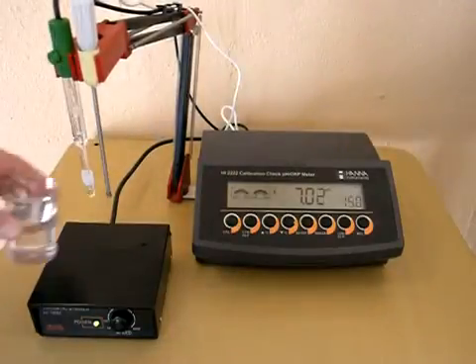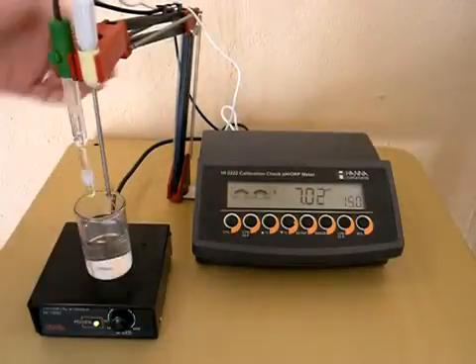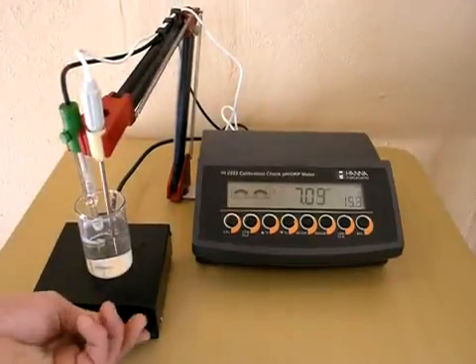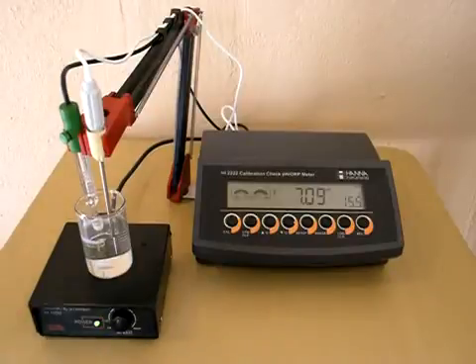We're going to give the probe a quick rinse with some deionized water. I'm going to place pH buffer 7.01 on the stirrer. The stirrer bar is in place and turn it on. Let the probe start to condition itself.